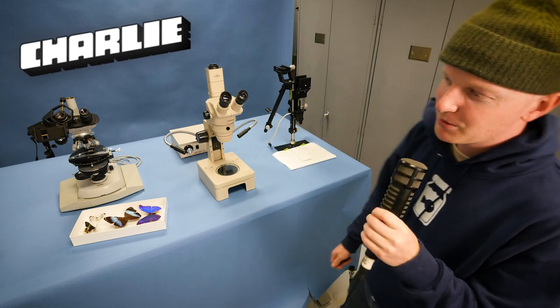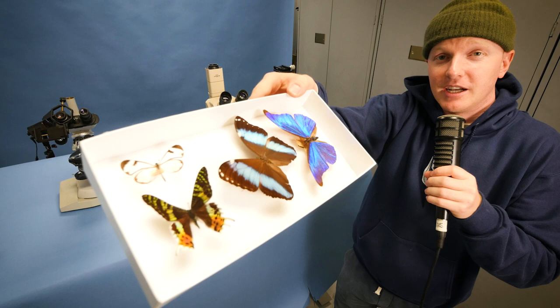Hey guys, what's up? It's Charlie from Odd Animal Specimens. Today I brought out a nice collection of butterflies from the insect collection that all look different. And a nice variety of microscopes here.